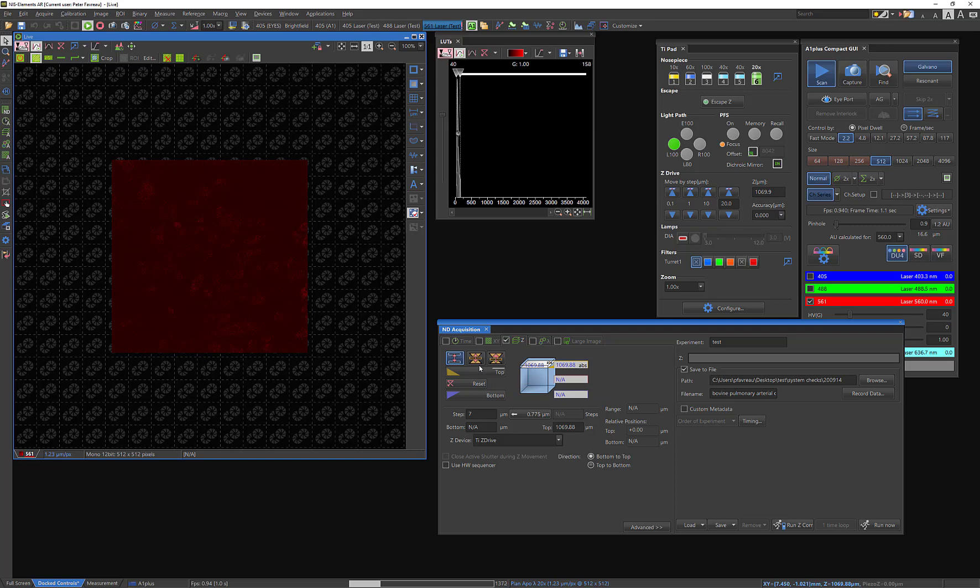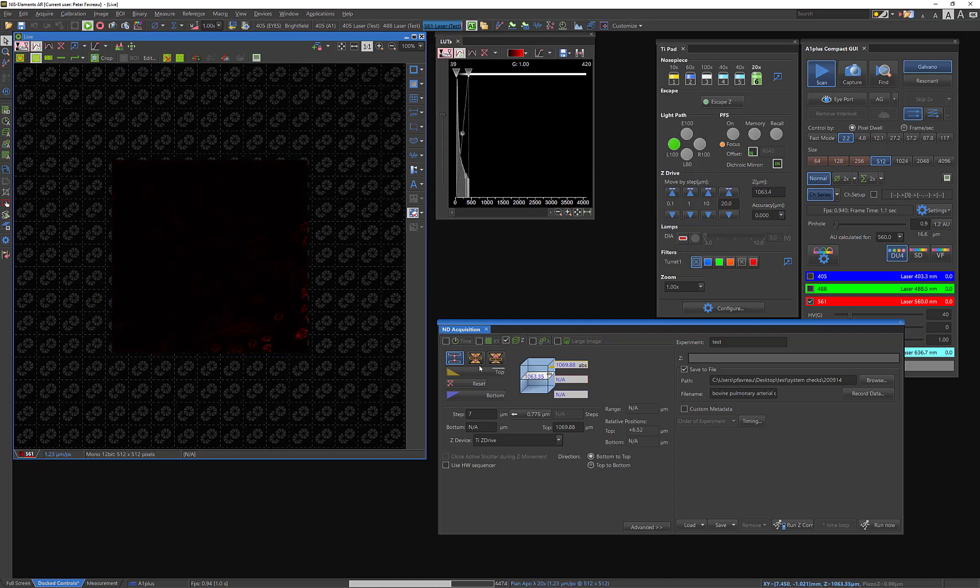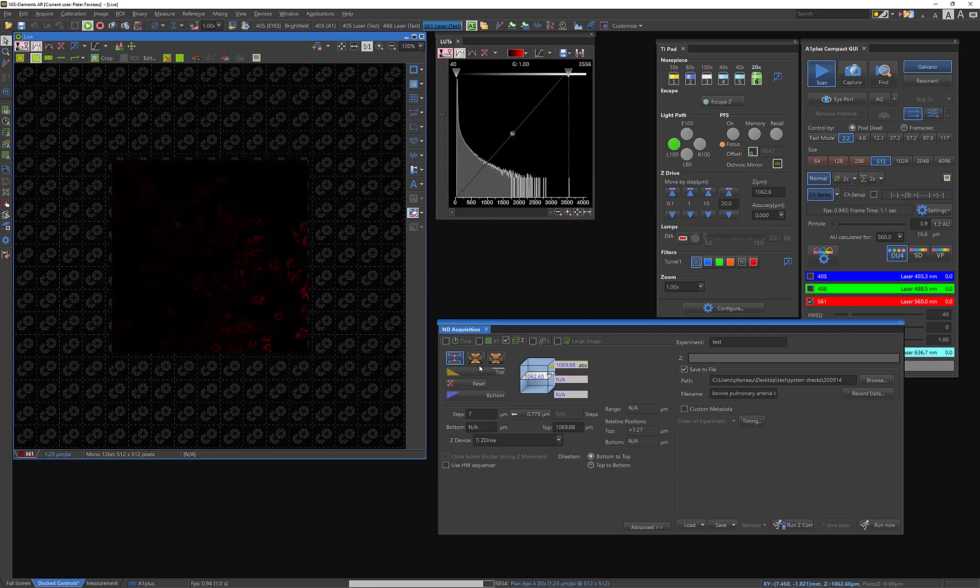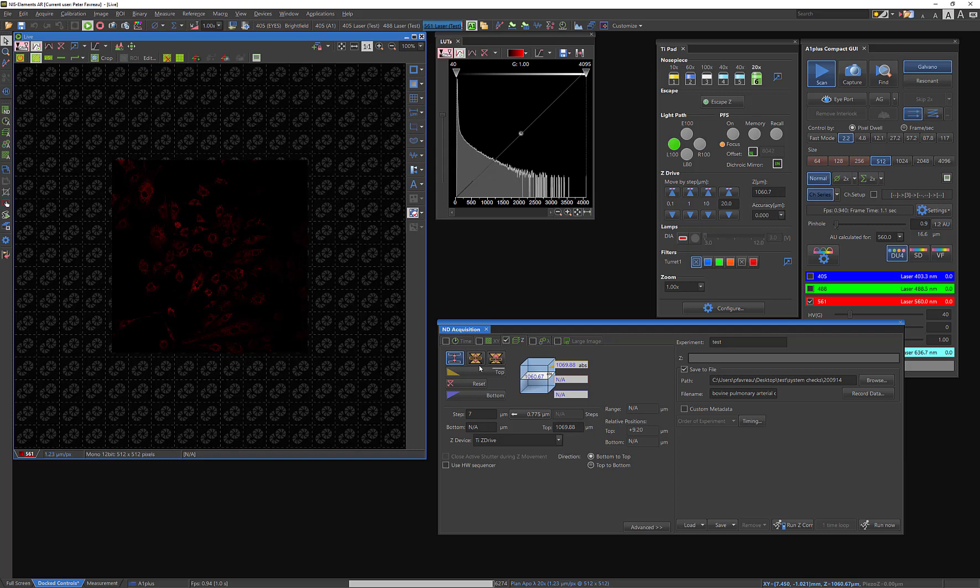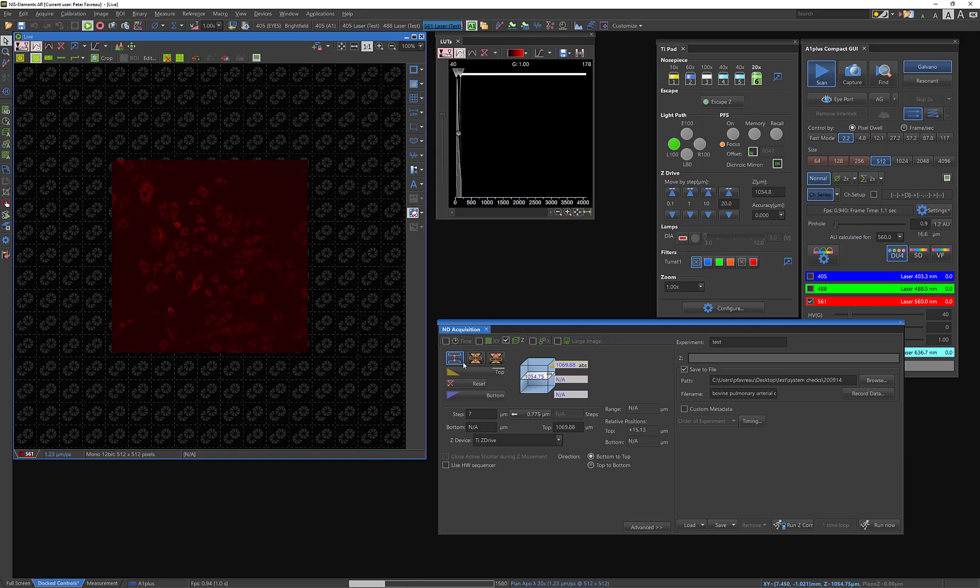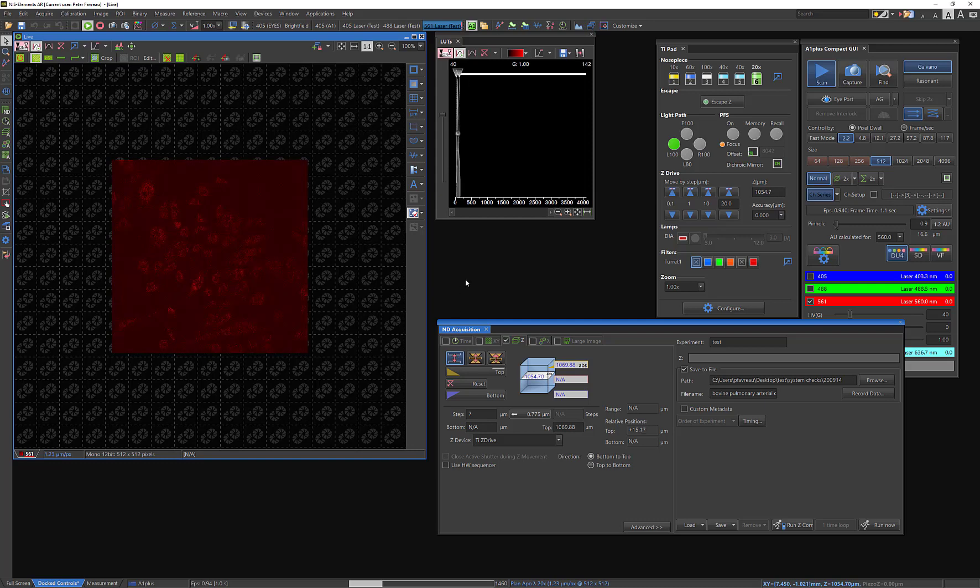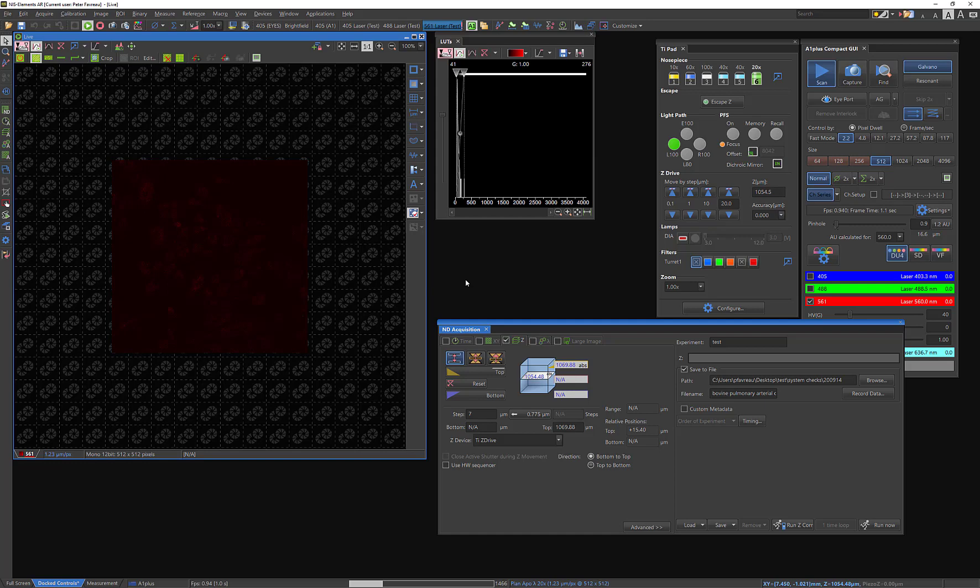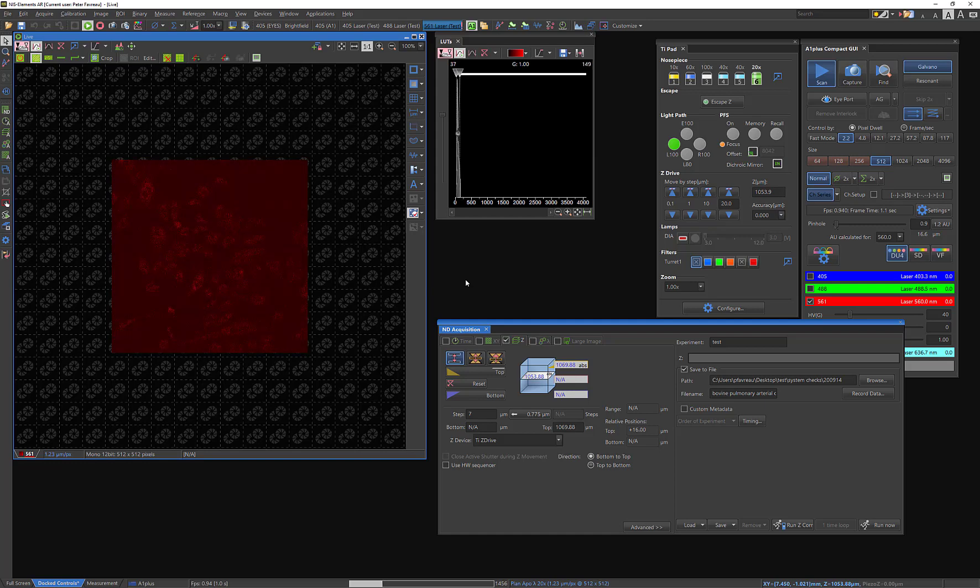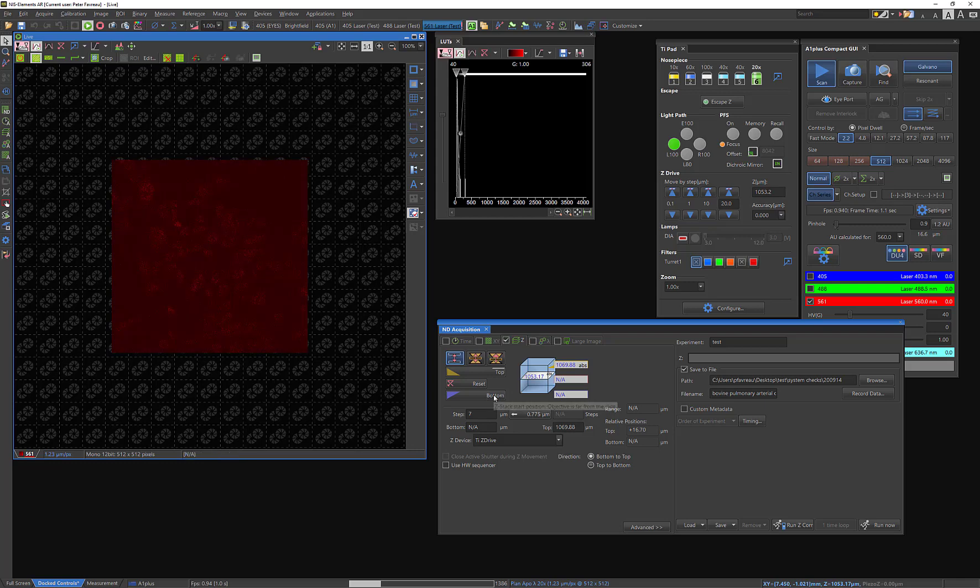And I'm going to go the opposite way now and find the bottom. As you can see, it's going through the same slices it was just going through. And I'm looking for the same level of non-focus, essentially, to find out where the bottom is. And when I say bottom, I'm really talking about a relative position here, right? I'm not calling this the actual bottom of my sample. This is just where it starts to go out of focus, and I can no longer resolve all the details in my image.